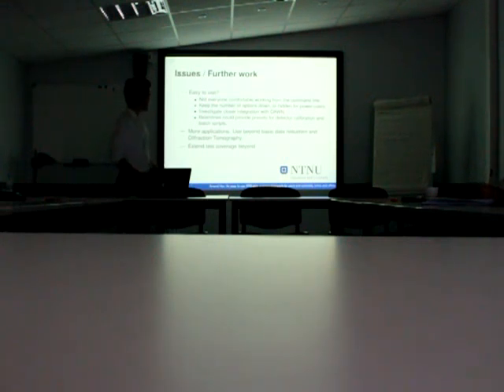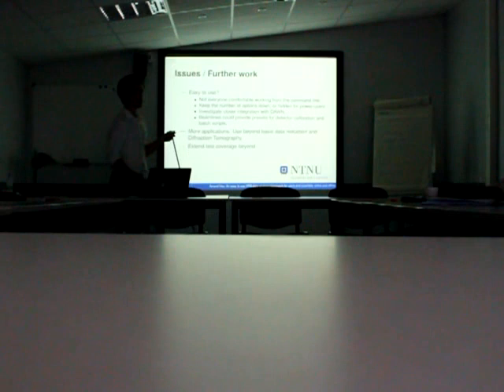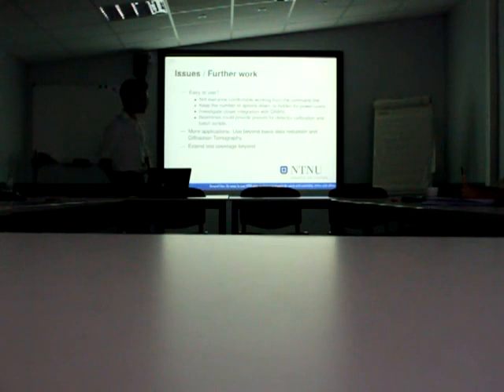For the work, I started with some unit testing of just the sample calculations, the form factors, attenuation coefficients, and so on. But it should be extended. Testing is very nice when you have some library and things break or change, but there's never time.